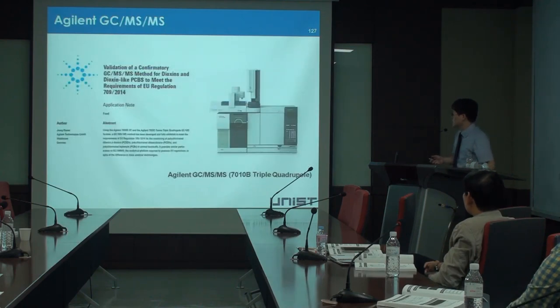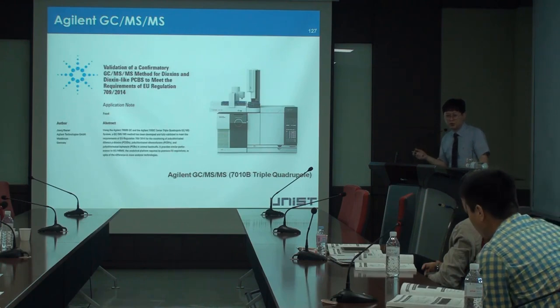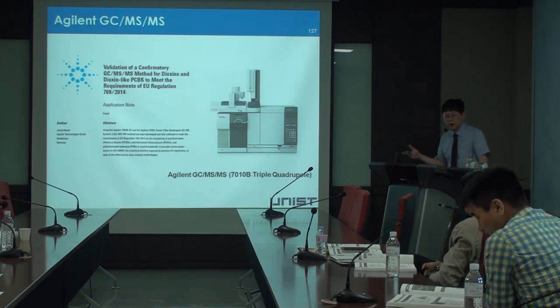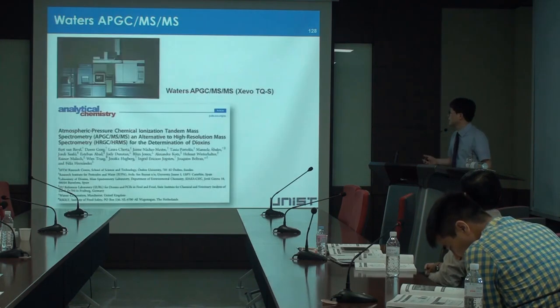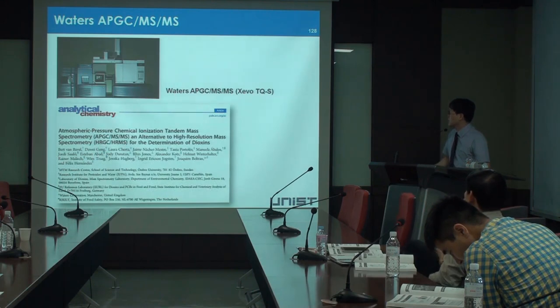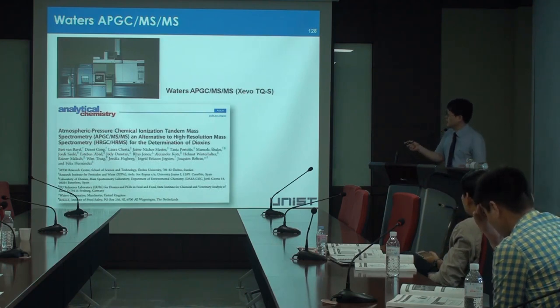Okay, this is a GC-MS/MS system, so you can download some application notes. Many commercial companies provide their data notes on how to analyze POPs using their GC-MS/MS system. And another maker, Waters, combines atmospheric pressure GC and an MS/MS system. Actually this system was made for LC, but they can switch to GC.